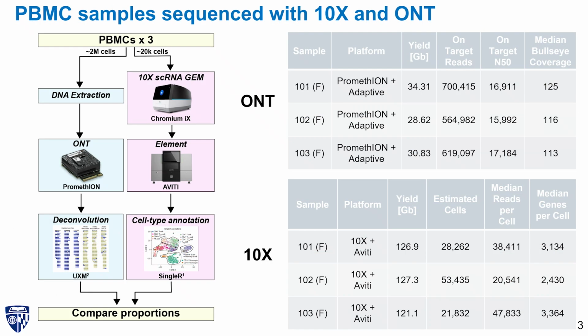So my student Luke Marina wanted to see, well, how well can we do this with nanopore sequencing alone? How well can we actually count how many different cell types we have with nanopore sequencing alone? So he took some PBMC samples and he did targeted nanopore sequencing using a method called adaptive sampling, which I'm not going to go into at this time. And he also did single-cell RNA sequencing, as the gold standard, because he figured that single-cell RNA sequencing would tell him exactly what the different cell type proportions are in his sample.